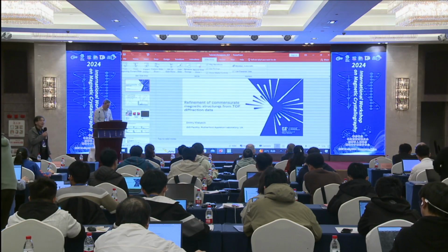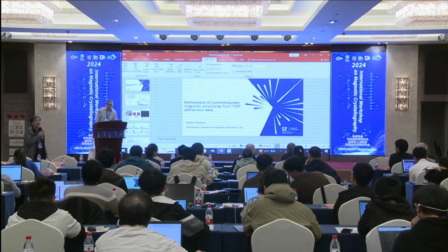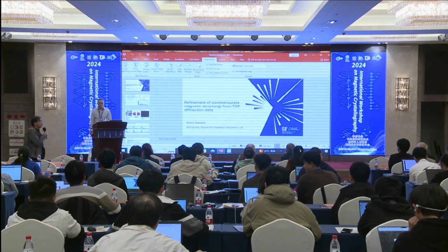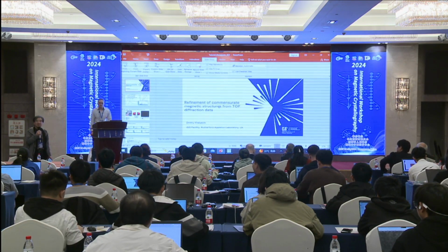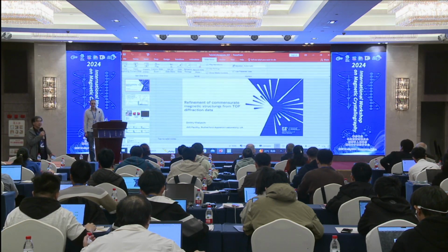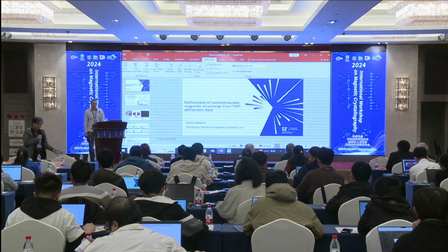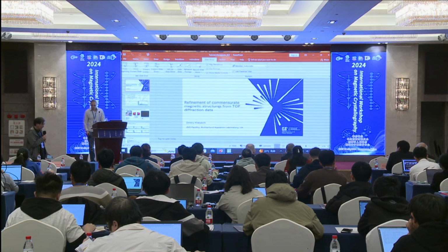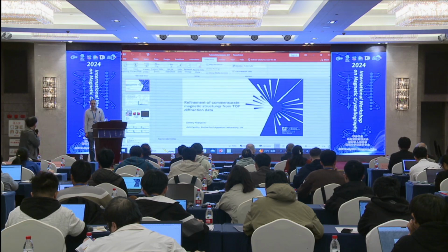Okay, we'll start. I'm very happy to introduce Dmitry Khalyavin. He's the instrument scientist of ISIS's WISH. And the WISH of ISIS is very, very famous among powder diffractionists, neutron powder diffractionists, as a very successful instrument. And most of the success should be owing to the instrument scientist.